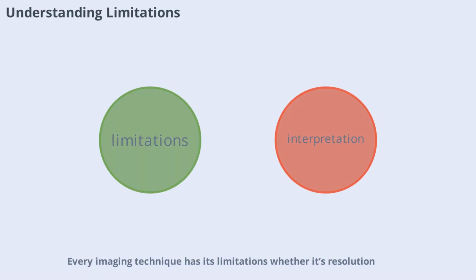Every imaging technique has its limitations, whether it's resolution, depth of field, or sensitivity to certain features. Being aware of these limitations helps you interpret your results accurately and avoid overreaching conclusions.